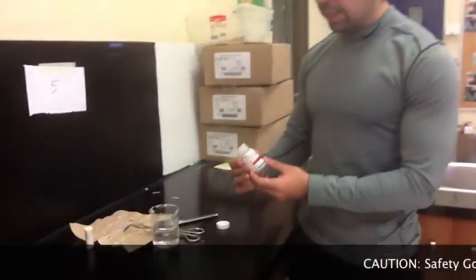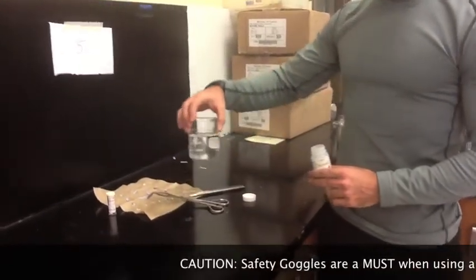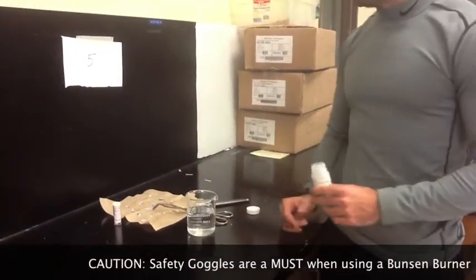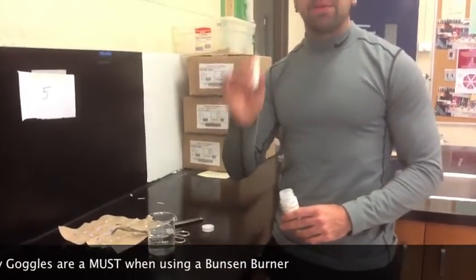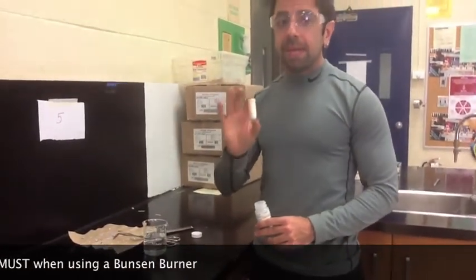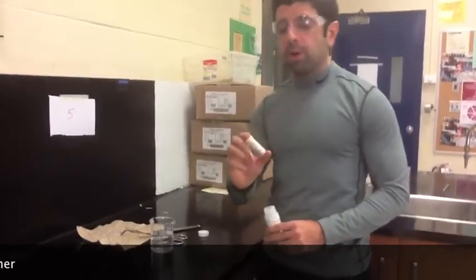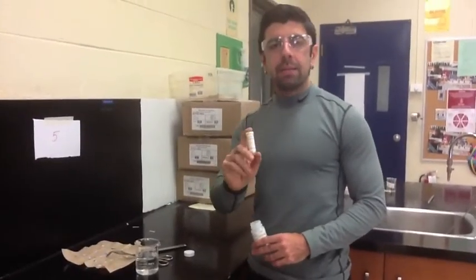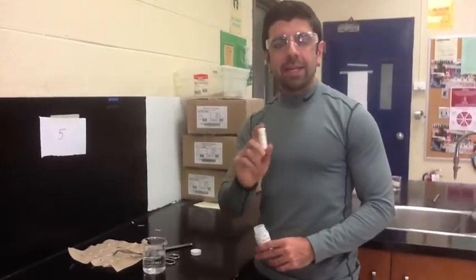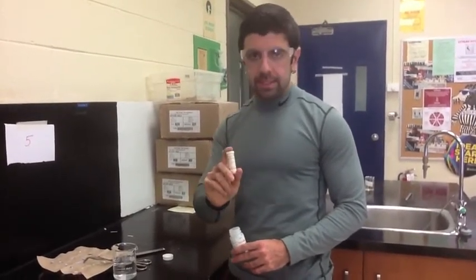In this station, we're going to be using calcium metal, just little pieces of calcium with a beaker of water. Again, safety goggles a must. Another thing we're going to be using is litmus paper. If you remember, when we talked about acids and bases, hint, hint, what we use litmus paper for. The paper we're using is red litmus paper. Red litmus paper will stay red in an acid. Red litmus paper will turn blue in a base.